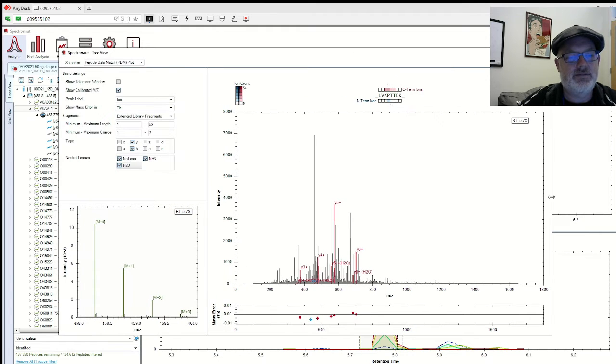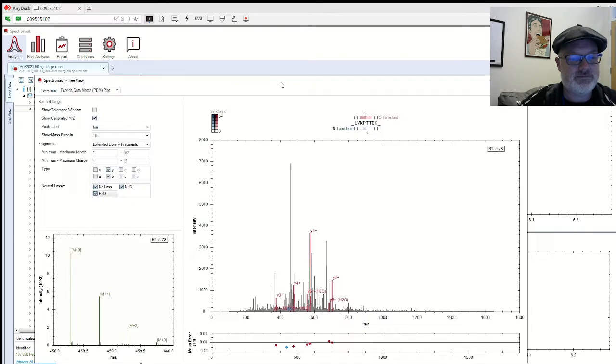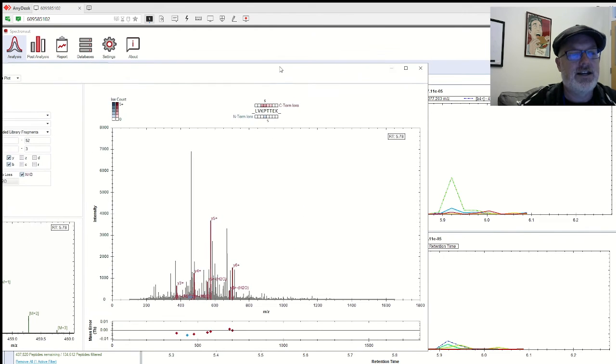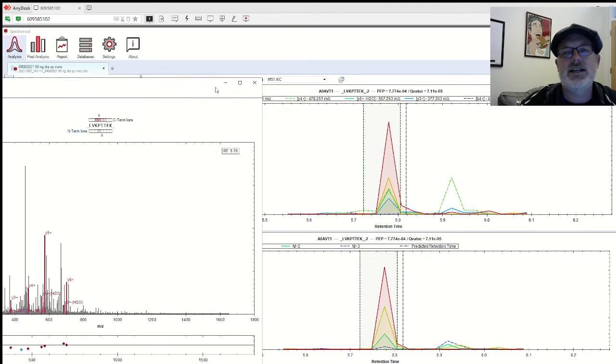Here is the MS-MS spectra. So you can see DIA spectra are very, very complex. Remember, MS-MS spectra from DIA contain maybe hundreds of peptides. So it pulled these out of the spectra, because these are the ones the deep learning prediction expects from this peptide. It finds them in the spectra. And Spectronaut says, hey, do these co-elute? They do co-elute, which is the upper panel. They all co-elute at the same time. That's this Y6543. You can see that here.